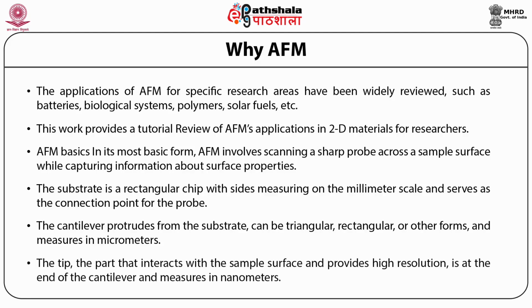The tip, the part that interacts with the sample surface and provides high resolution, is at the end of the cantilever and measures in nanometers.